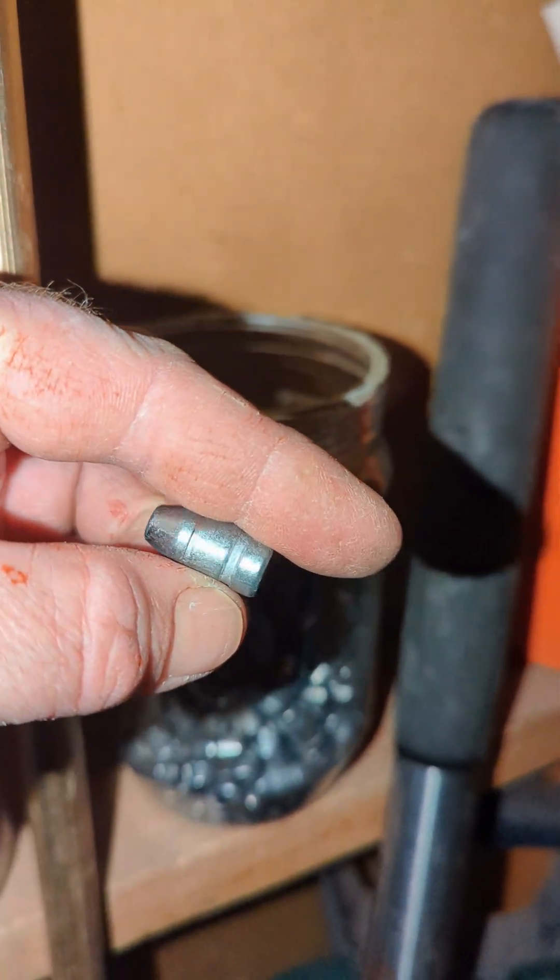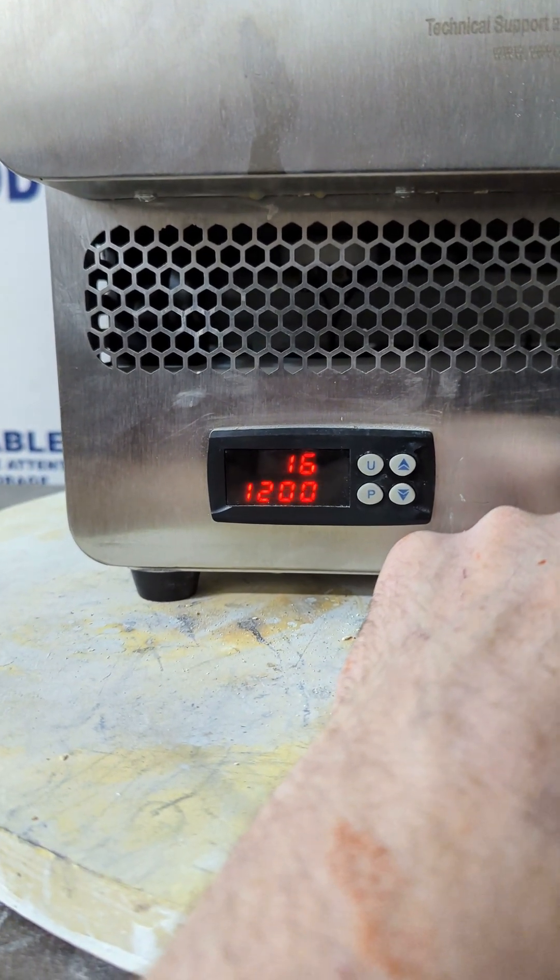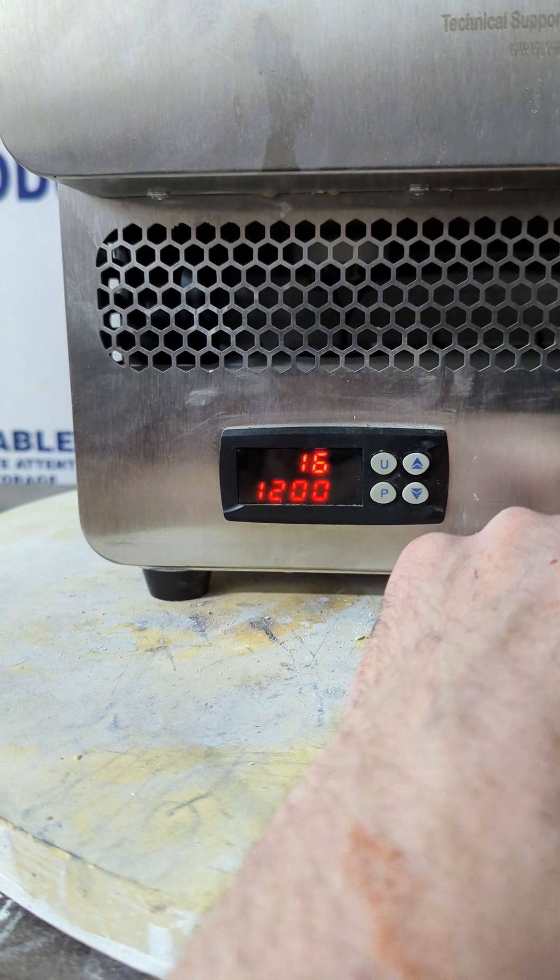Thank you, Charlie at Path of the Bee. Preheating the kiln to 1,850 degrees Fahrenheit — in Celsius, that will be 1,010 degrees.